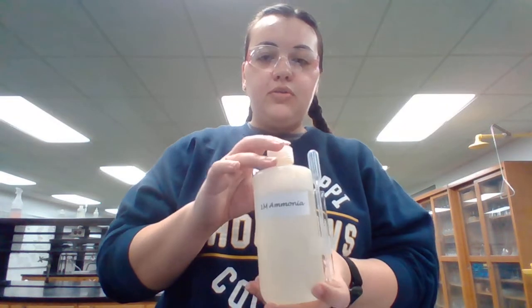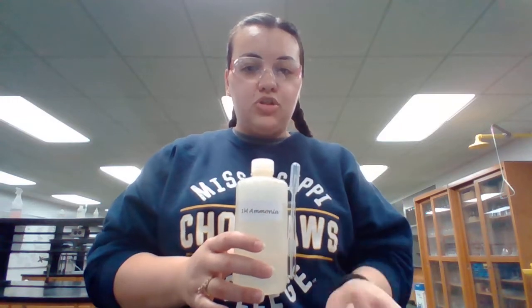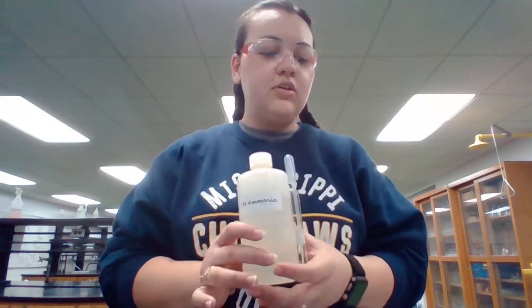So step 4 tells you to measure out 15 mL of 10% magnesium sulfate heptahydrate into a graduated cylinder and add that to your beaker. Step 5 tells you to get 15 mL of 1 molar ammonium hydroxide. Make sure that you don't have any of the previous solution left in your cylinder. Wash it out before you put the ammonium hydroxide in. And also, you guys will actually have 1 molar ammonia. They're both a base, so don't panic if you can't find one that says 1 molar ammonium hydroxide. The 1 molar ammonia will be fine.